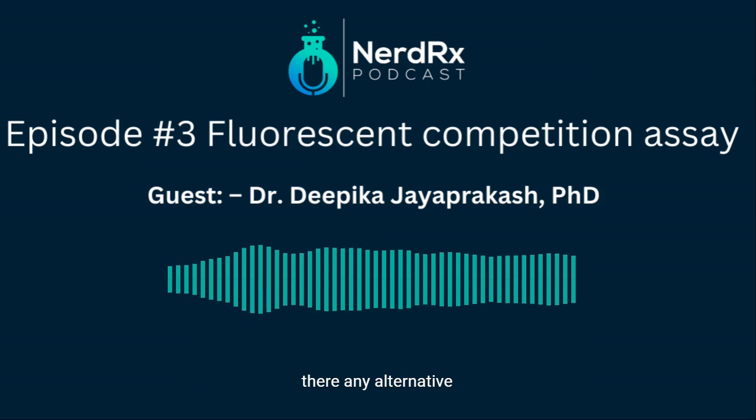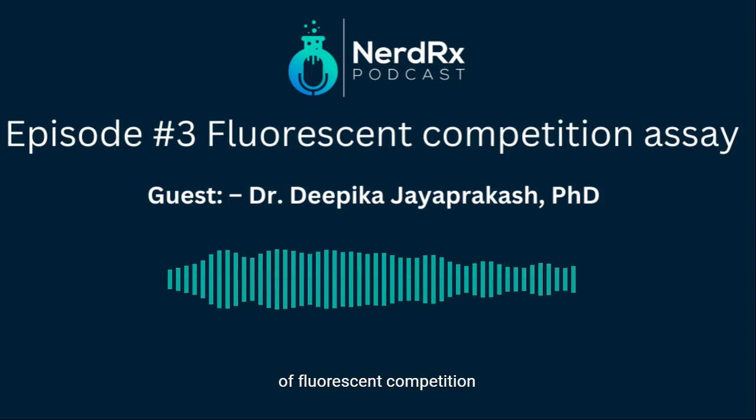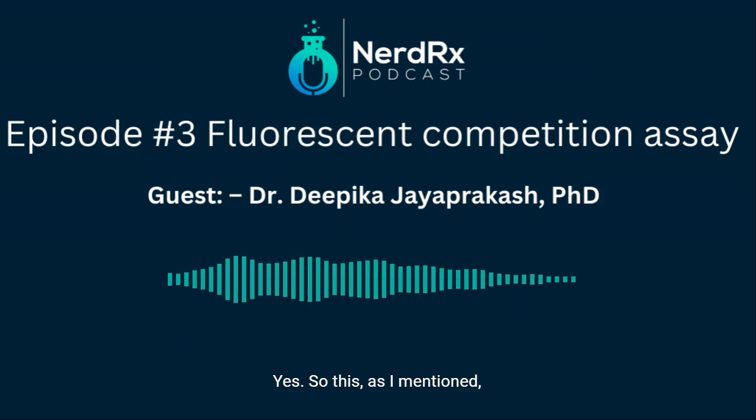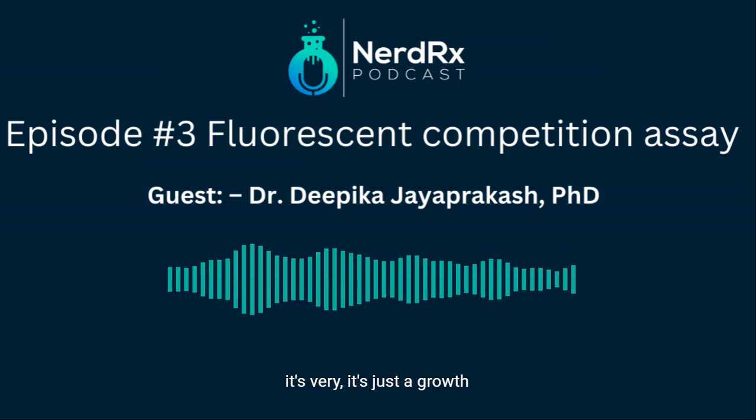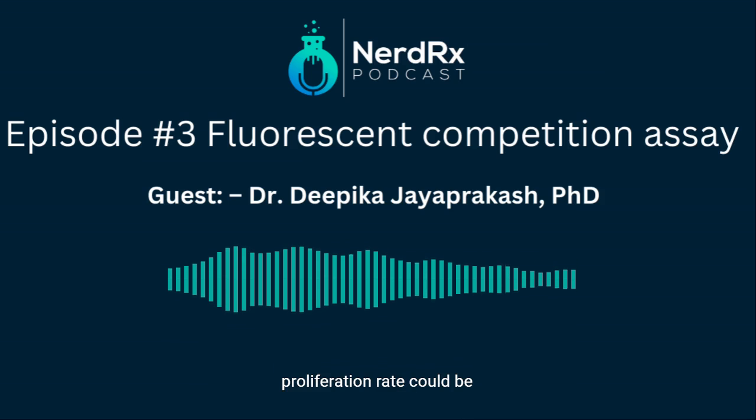Are there any alternative techniques we can use instead of the fluorescent competition assay to get the same results you're looking for? Yes. As I mentioned, it's just a growth rate or proliferation rate assay. So any assay that will determine the growth rate or proliferation rate could be used.